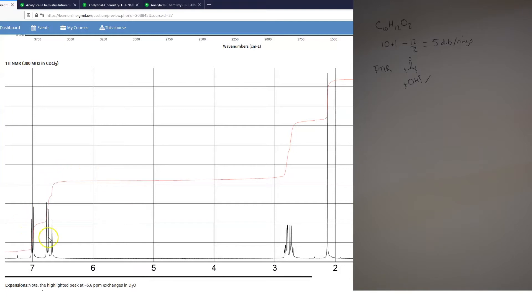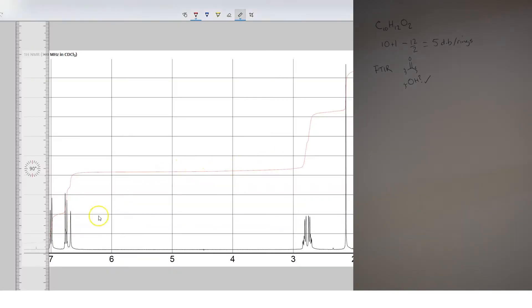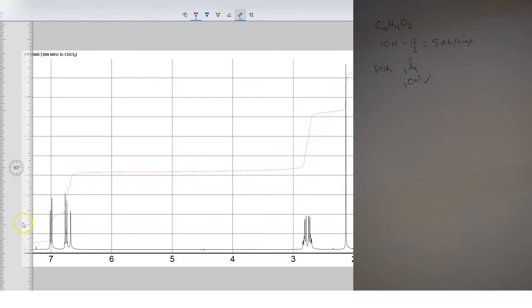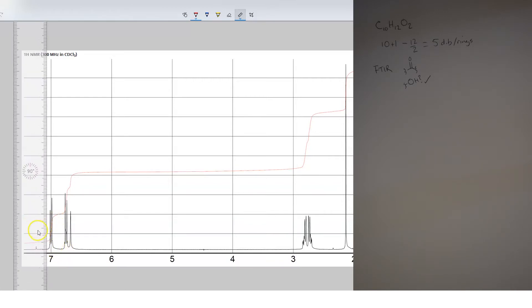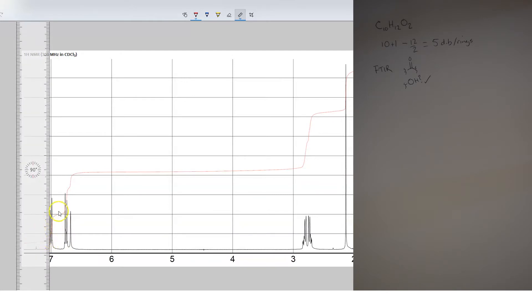The next thing we want to do is integrate our NMR so we can see how many protons each signal corresponds to. Out with the ruler — we always measure from where the baseline starts to rise to where the signal returns to the baseline. That height corresponds to how many hydrogens that signal is caused by.